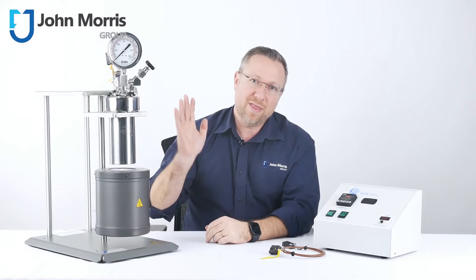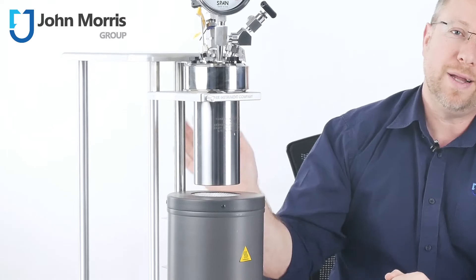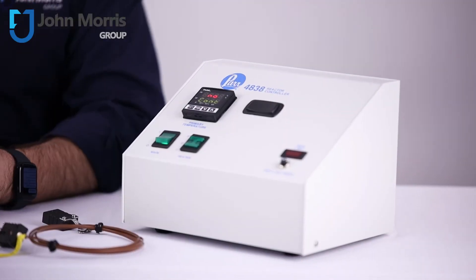Let me start by showing you what this particular system consists of. You've got a head, a closure, a benchtop stand with heater, and to the side is the 4838 controller.